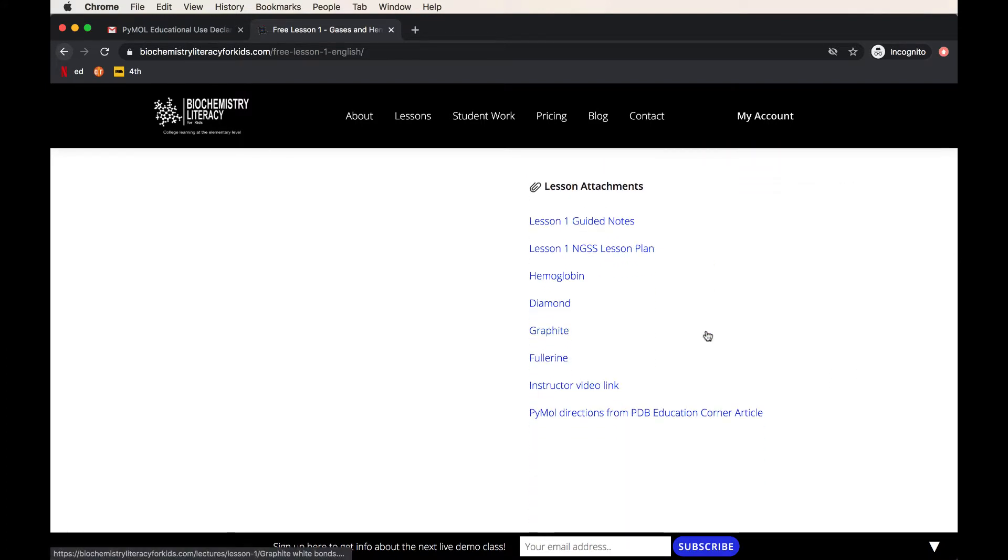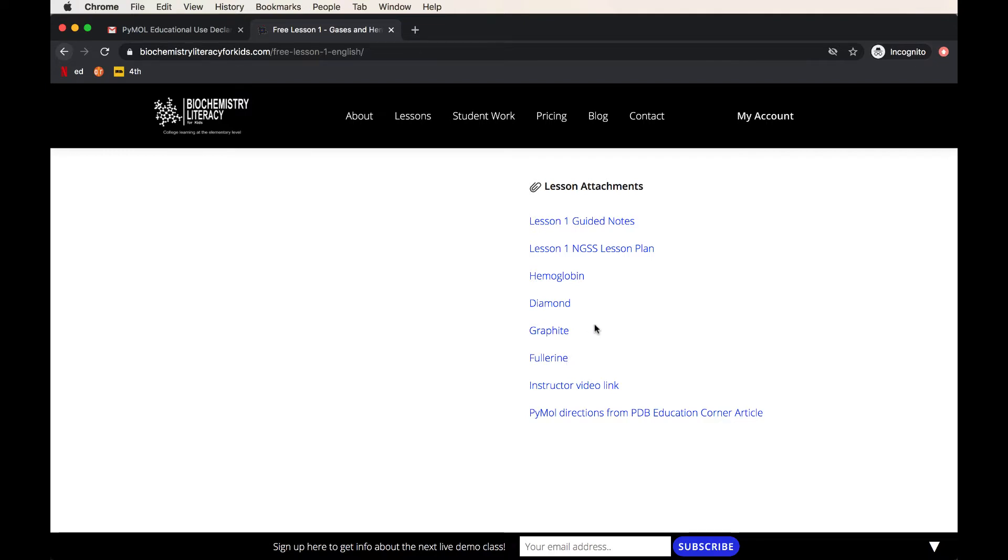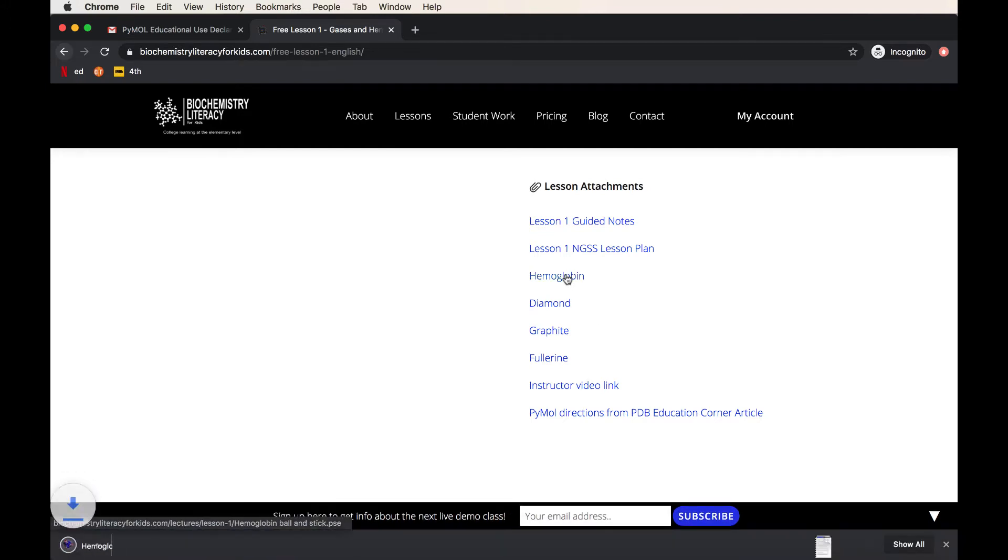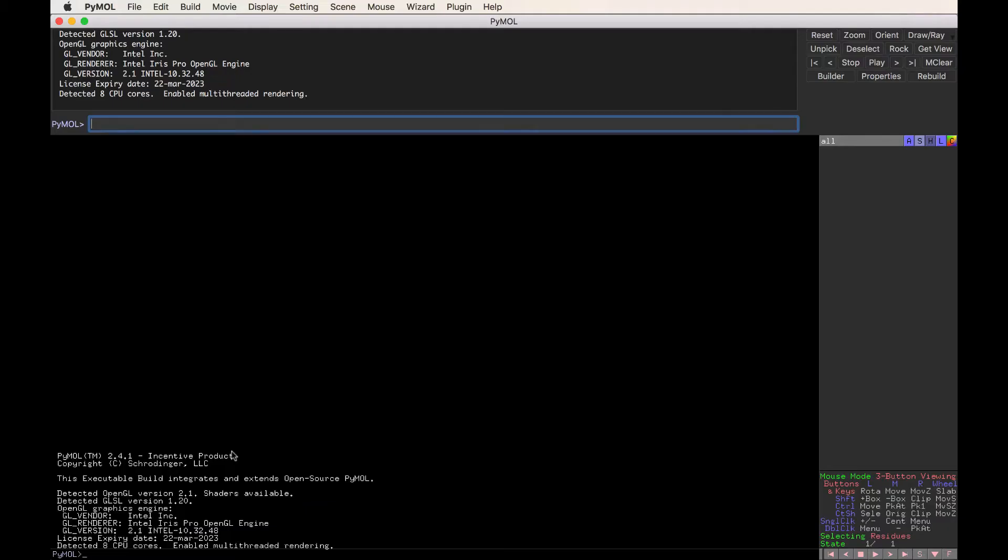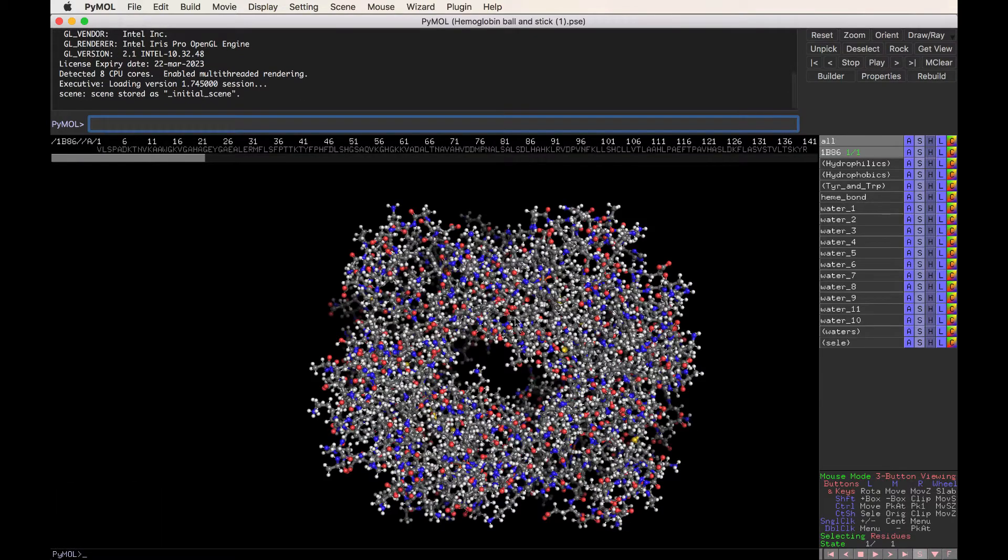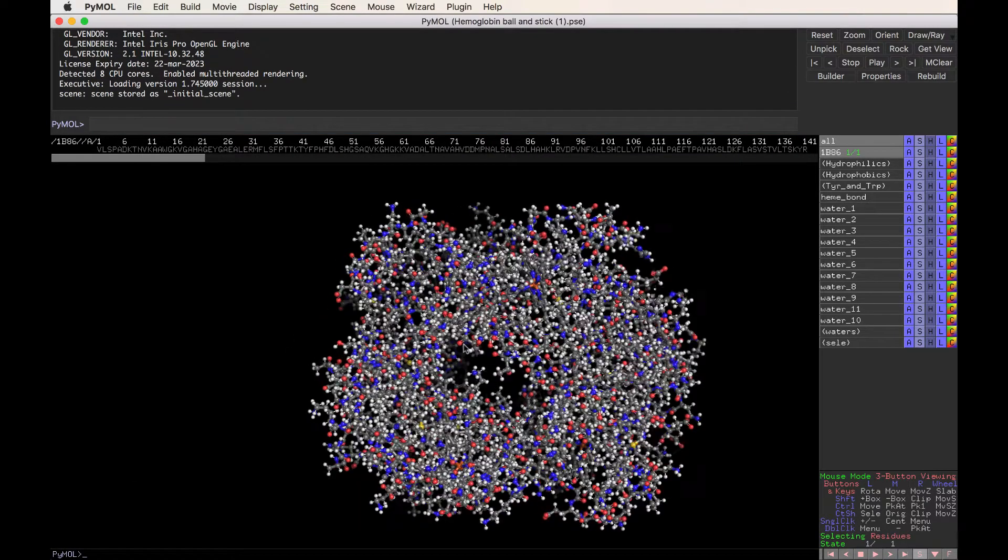But if you scroll down, you'll also see a video link, which is basically me talking and giving the first lesson. But if you scroll down more, you're going to find the lesson attachments. And this is what we're interested for our lesson right now. We're interested in these files right here, which are PyMOL files. There are .pse files, and these can be automatically opened on PyMOL. The coolest structure to look at on this list here is the hemoglobin, and we're actually using hemoglobin a lot in the first lesson. So click on the structure, retrieve it from your downloads, and the structure should automatically open in PyMOL.